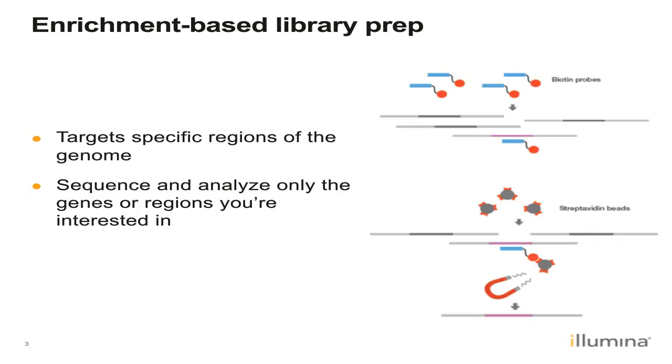All right, to start, just taking a quick look at what an enrichment library prep entails. And as it sounds from the name, it does enrich your pool of potential DNA fragments to those that you are targeting, things that you're interested in. So this can be used to either analyze more samples in a single run, or analyze single samples more deeply just in the regions that you're interested in.